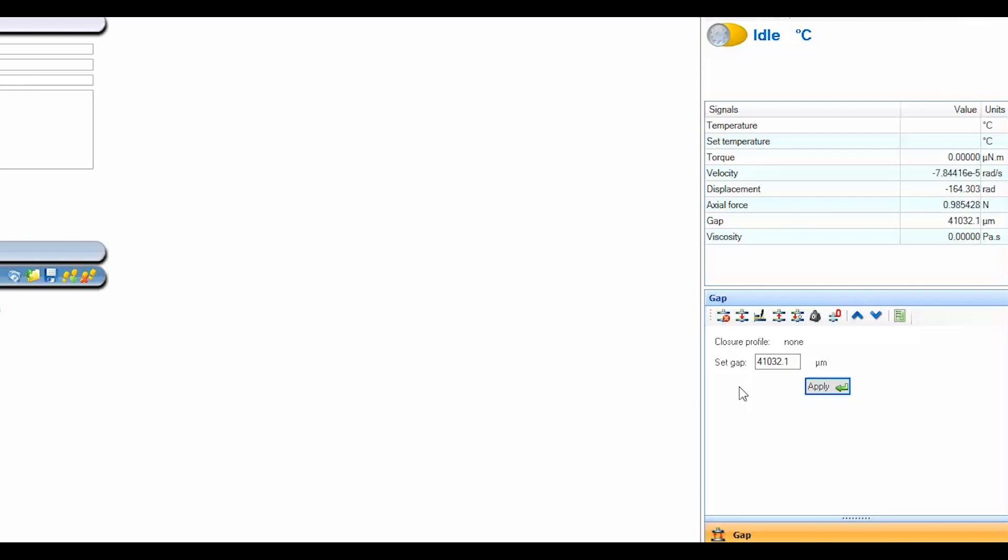Use this icon to zero the geometry gap. Then, use this icon to raise the instrument head and load the sample. After sample loading, press this icon to go to the trim gap. After trimming, use this icon to go to your final measurement gap.